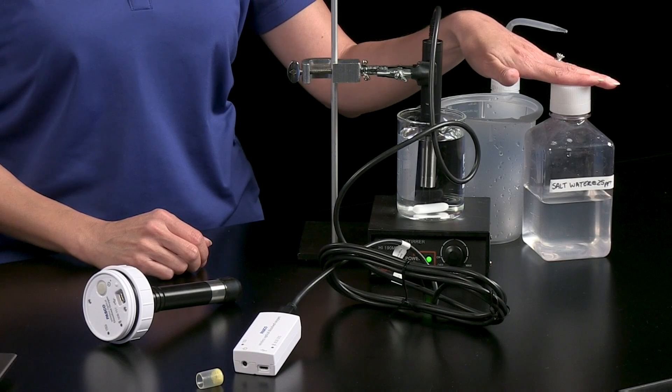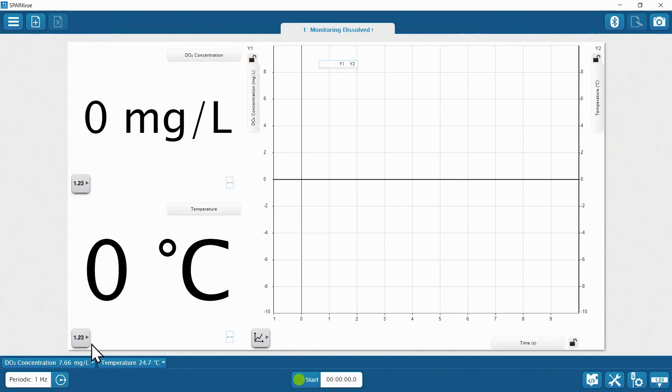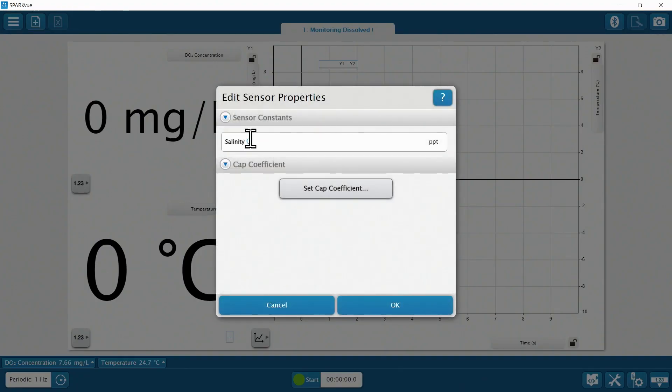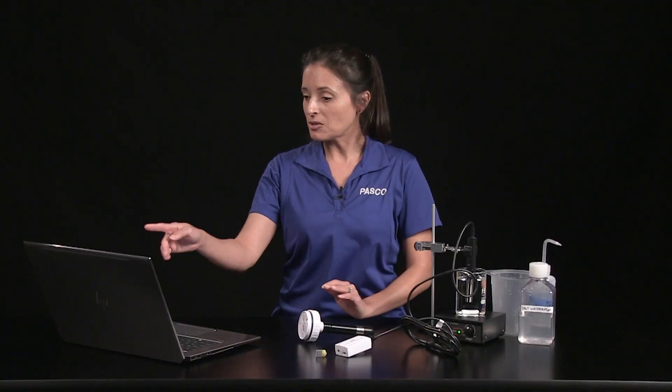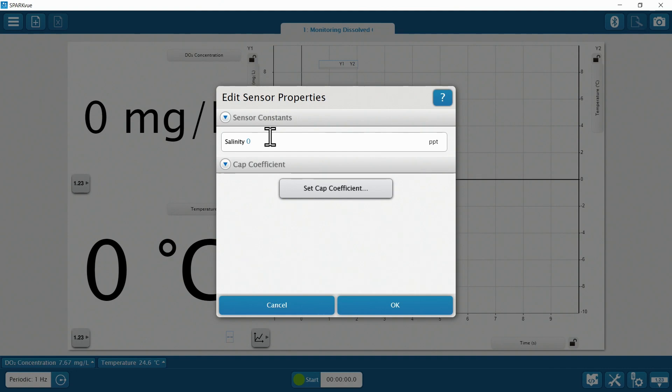The ODO sensor is set up to measure freshwater samples by default. If you are testing brackish or saltwater samples, you must adjust the salinity constant. Configure the sensor properties to modify the salinity constant in parts per thousand, or PPT, as measured with a salinity sensor. The sensor will store whatever value you enter here, so it's a good practice to return the constant back to zero when you're done with your measurements, unless your sensor is dedicated to measuring saltwater samples of similar salinity.